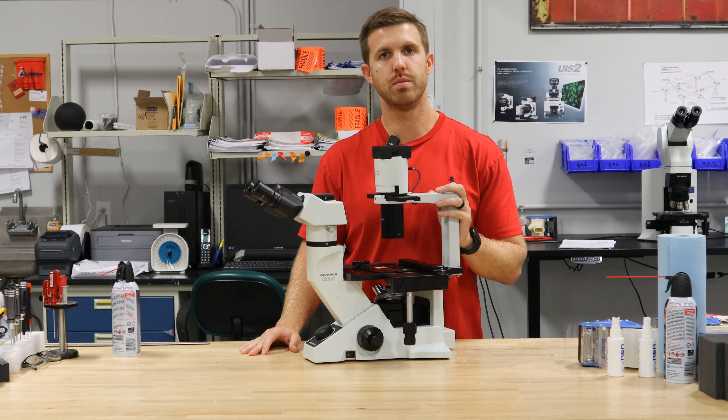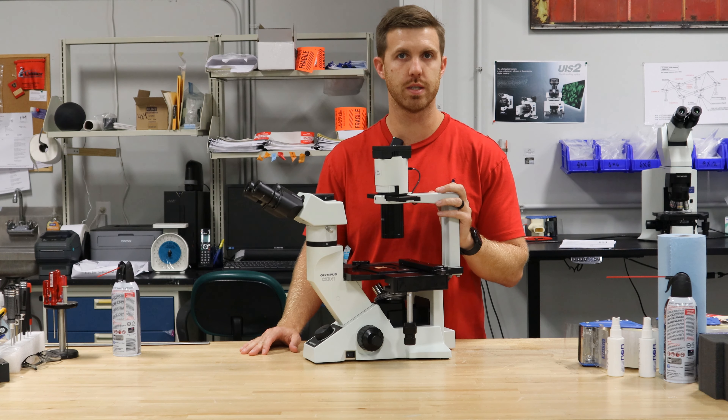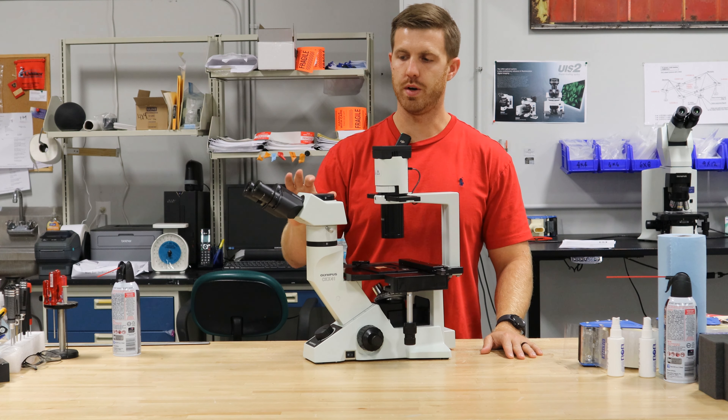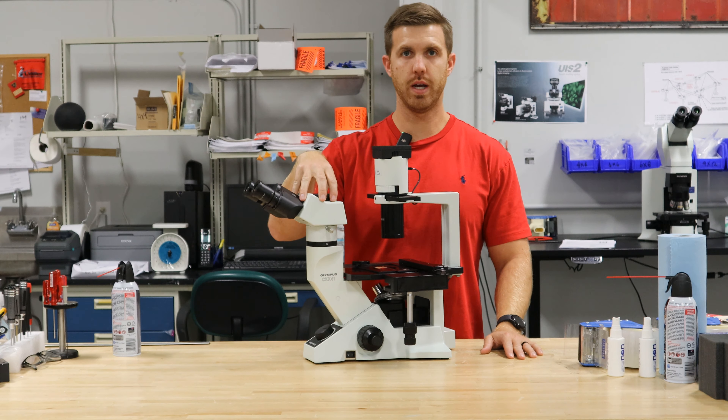A lot of these scopes are going to use the 4x, the 10x, the 20x, and some of them go up to 40x for this particular application. On this one we have your eyepieces in the head. We have the viewing head here — you can have a couple different ones: a trinocular, an ergonomic, or a tilting. This one happens to be a trinocular head.